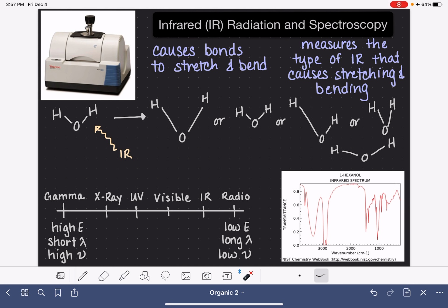In the next few videos, however, I'm going to be teaching you how to analyze the different features of the infrared spectrum so that you don't need to rely on a database in order to interpret the results.